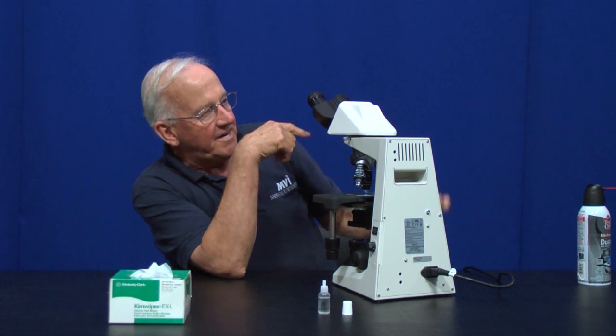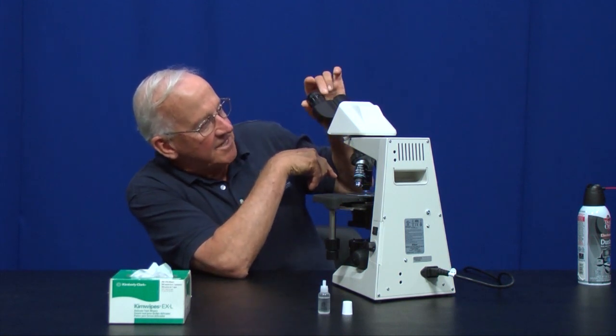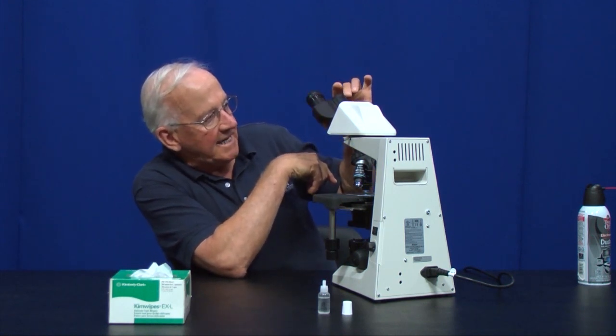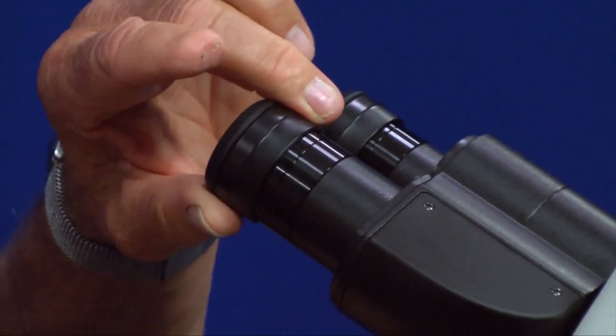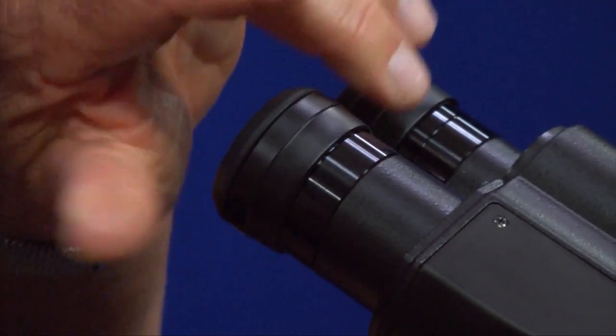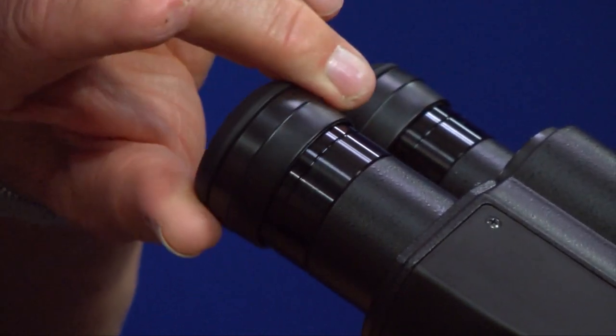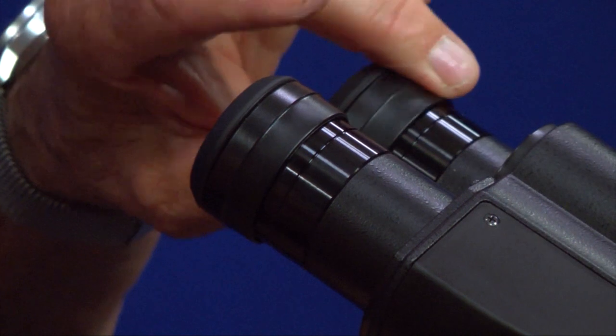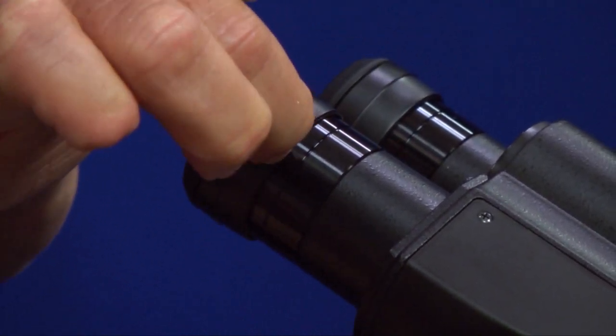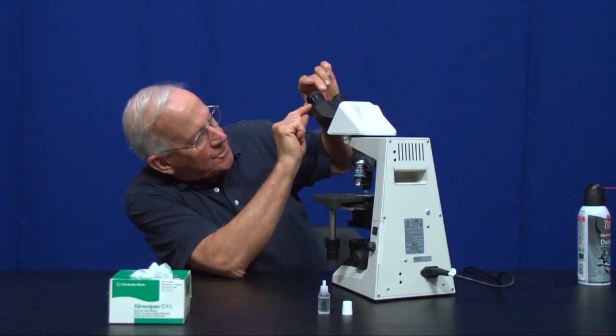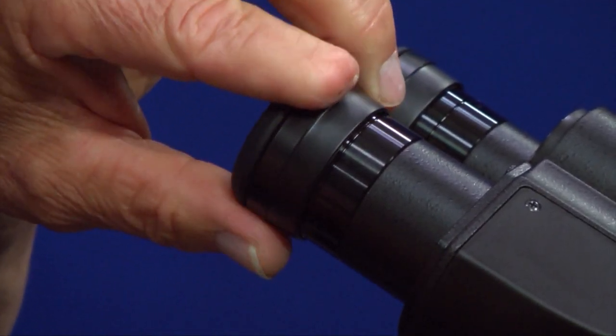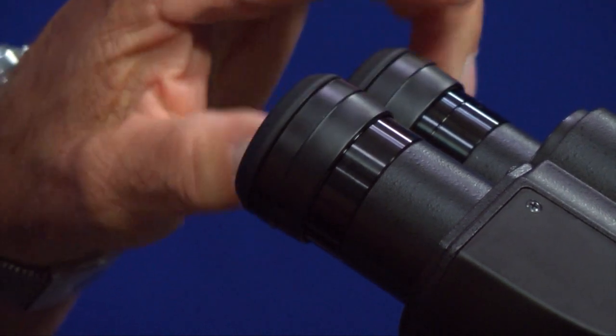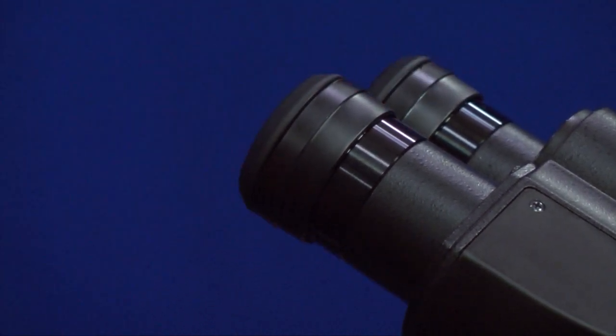The eyepieces, these 10x wide field eyepieces, it's very important that they are set at the proper height. You see that both of them are focusable. You should unscrew the eyepieces all the way up to the top, and then you will see a groove around the eye tube, and then screw them in until you can just barely see the groove on each eye tube. That means the eyepieces are set properly.